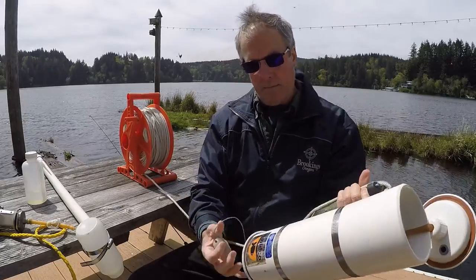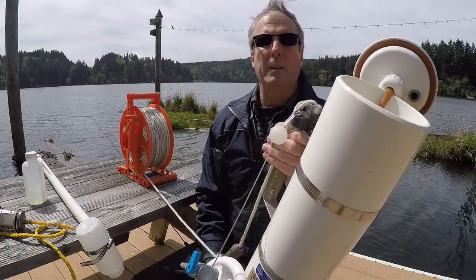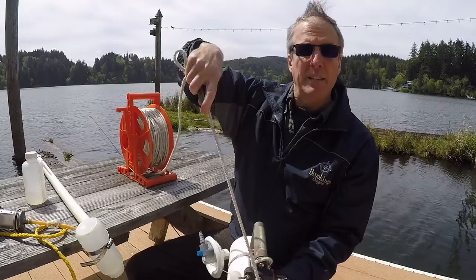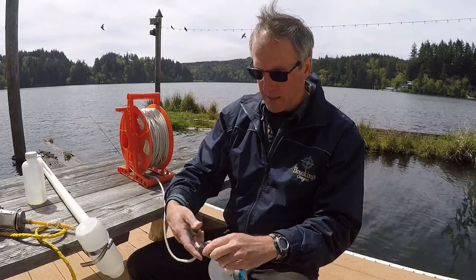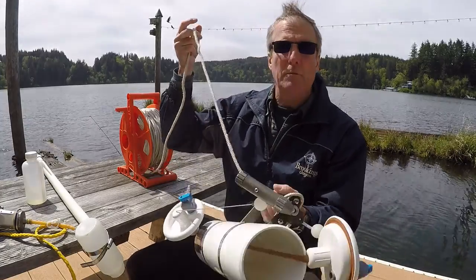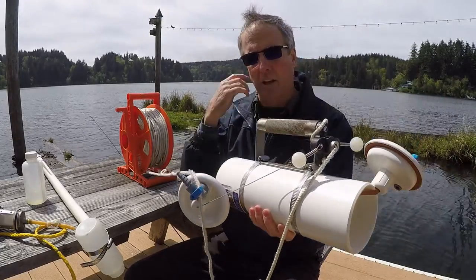I'm going to do the same thing on the other side with this pin, and it just sits over the top like that. So now our bottle is open. So you kind of imagine if I'm on a boat and I'm trying to get a sample off the bottom, I can now lower the whole thing down into the lake without the water inside here being trapped in here at a particular depth, because the water will just kind of flow in and out as it goes down.